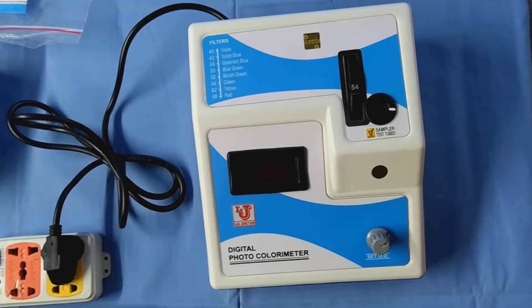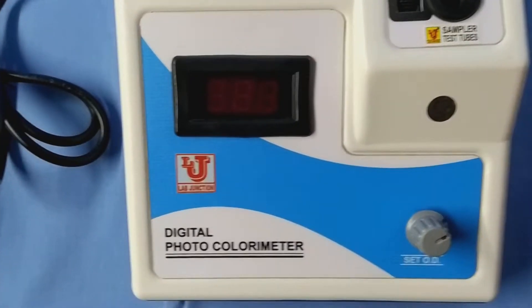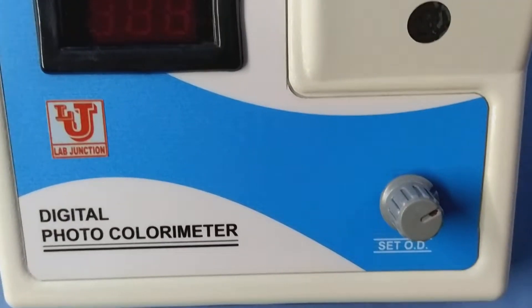Lab Junction's digital photocolorimeter, model LJ312.